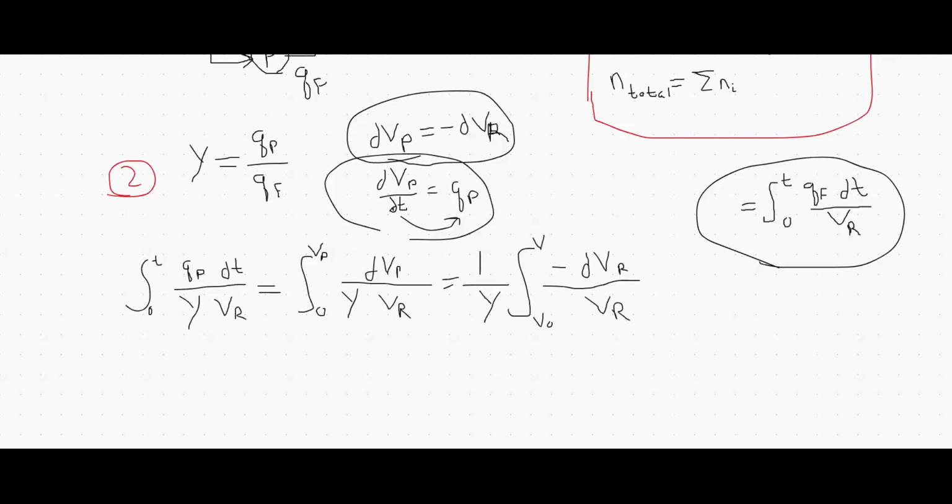That's like the V final. I guess we can put an F here. And then another thing is, outside of the integral, we can add just n, and it's accounting for diafiltration and the number of diavolumes. I'll let you think about why that makes sense a little bit, but really it should be kind of straightforward, right?